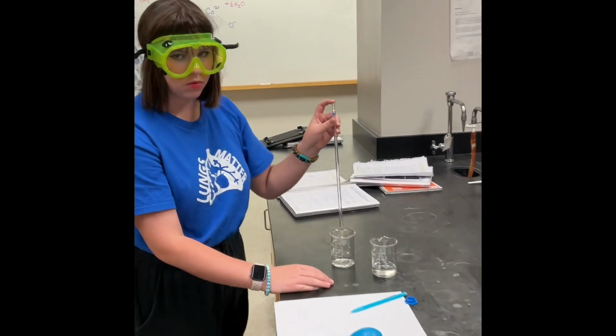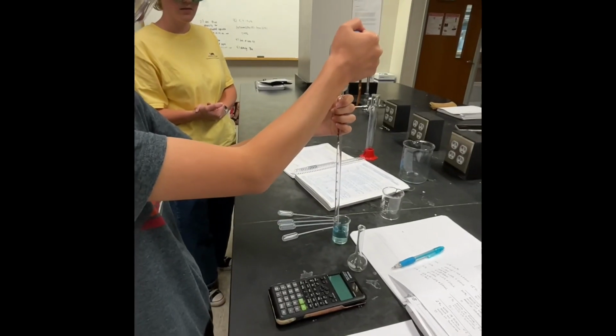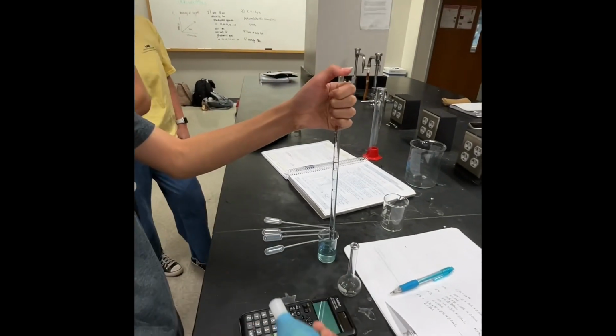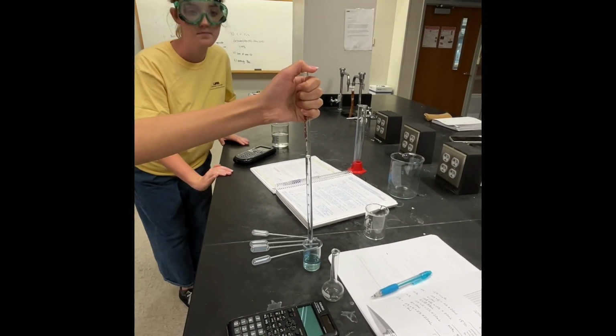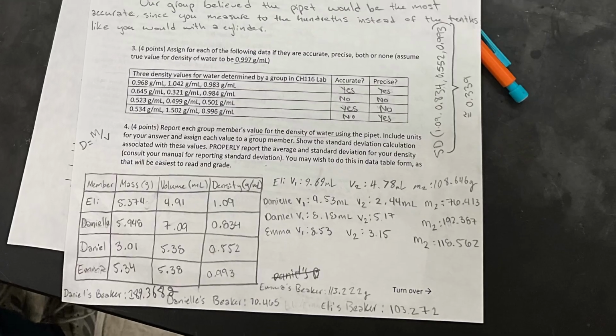Do not empty the graduated pipette completely. Record the volume of solution remaining in the graduated pipette to determine the volume delivered. Do this as many times as needed to get the intended V1, and then add water until the solution is at the new V2. Weigh the solution subtracting the beaker's original mass to get the mass of the solution.